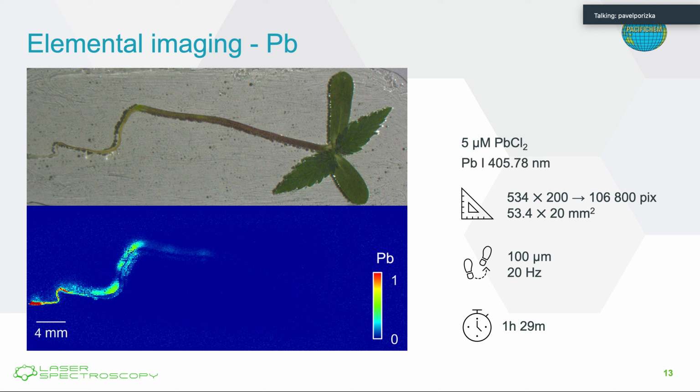Again, you can see the scale and so on. So you can see that LIBS can give you some really interesting results in terms of imaging.